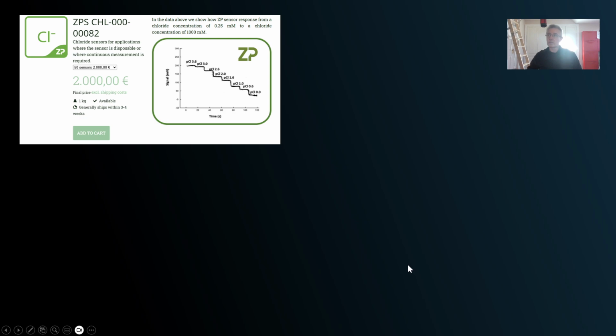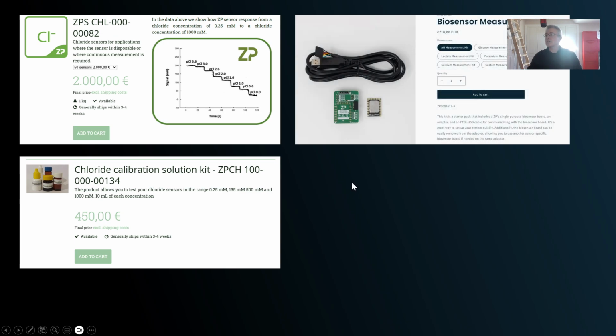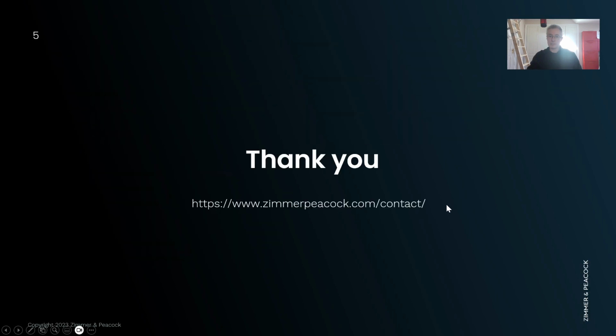What I'm showing you is what we've got. So just FYI, if you want the electrodes, we've got the electrodes. It's a good idea to start off with known solutions, so we'll also link to test solutions, and we'll also link to the electronics. So understand that if you start inventing your own electronics and you say, well, it doesn't work, then the question is: is it the sensor or is it the electronics? So we do ask you, at least in the early days, to purchase ZP's electronics.